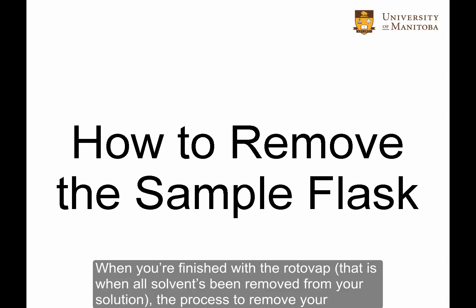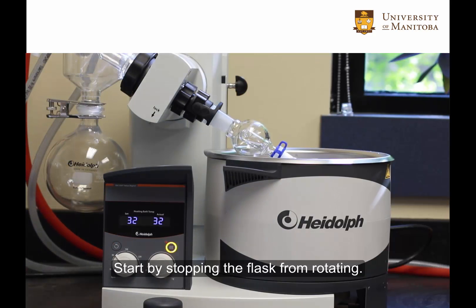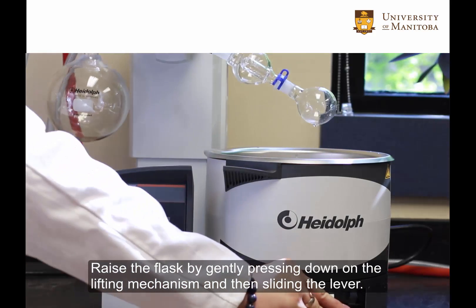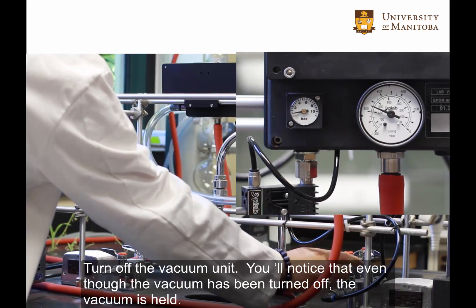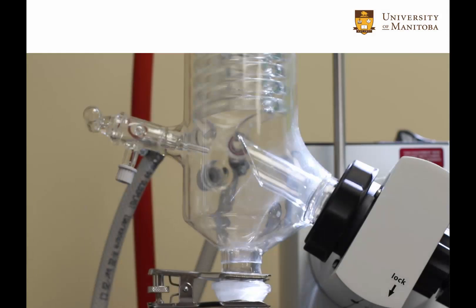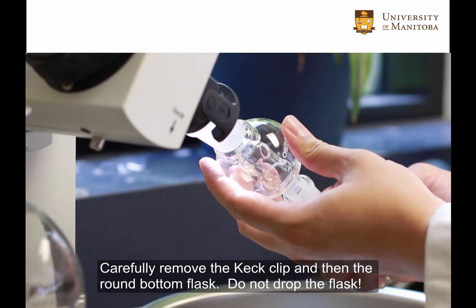When you're finished with the Rotovap — that is, when all the solvent is removed from your solution — the process to remove your flask is more or less the reverse order of how you got started. Start by stopping the flask from rotating. Raise the flask by gently pressing down on the lifting mechanism and then sliding the lever. Turn off the vacuum. You'll notice that even though the vacuum has been turned off, the vacuum is still held. Open the air inlet to break the vacuum in the system. Carefully remove the keck clip and then the round bottom flask. Do not drop the flask.